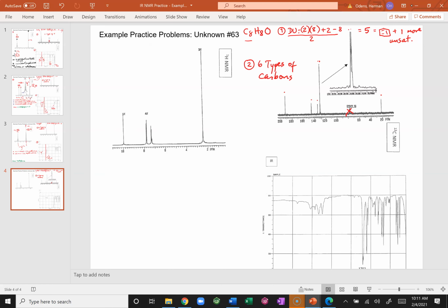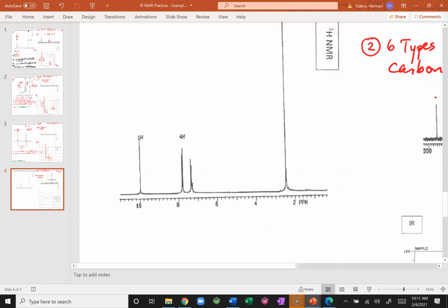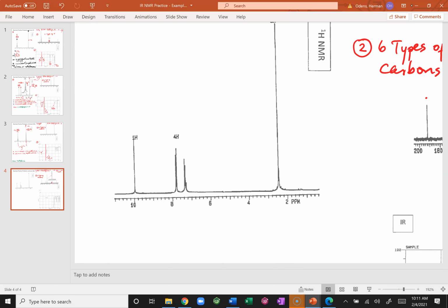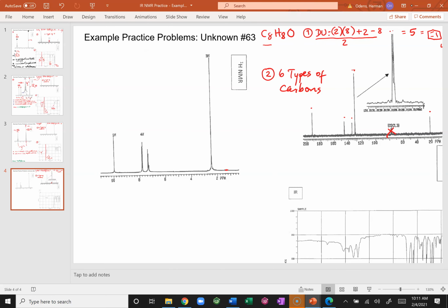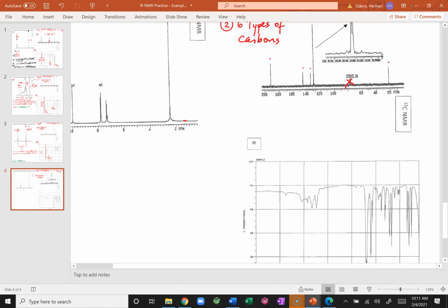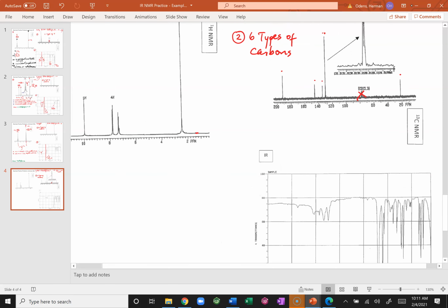This is what I told you about standard samples in the lab last Tuesday. Notice how clean these things are. Like there's very, very little impurities. You can almost ignore that. The number of carbons is exact. The infrared, the proton NMR is really clean. There's not a lot of grass. And yeah, it looks good.